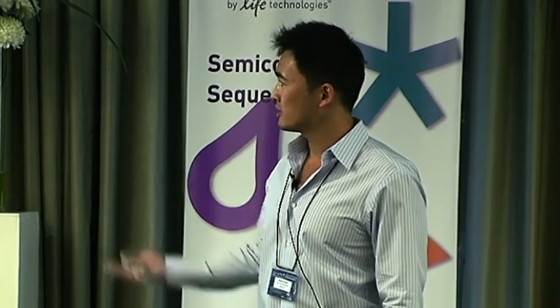And then the last bullet point, which you don't see because I forgot it, and it's the most important bullet point, is really the key question and answer session. So I hope I can spur some discussion. We have plenty of time before lunch, and without further ado, let me launch forward into TaqMan chemistry.